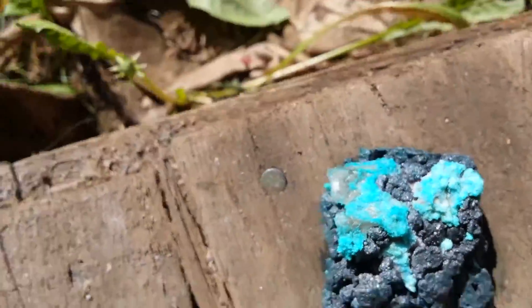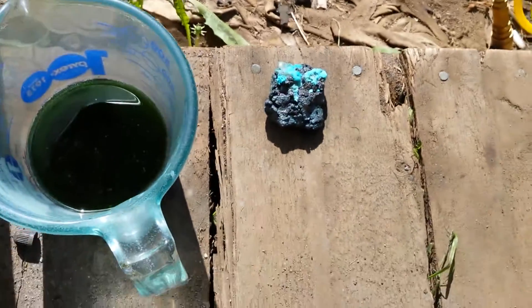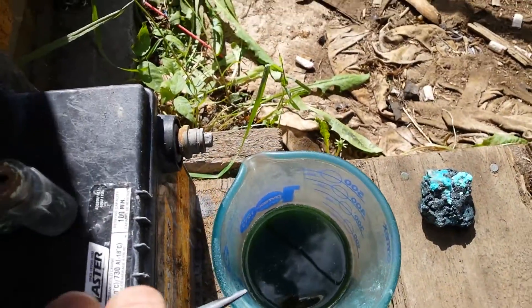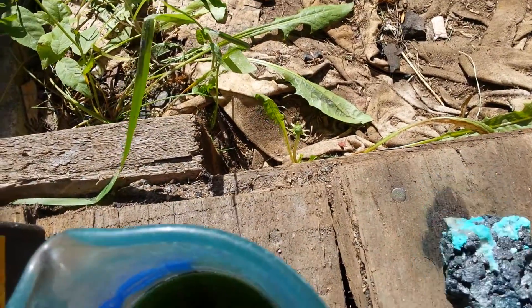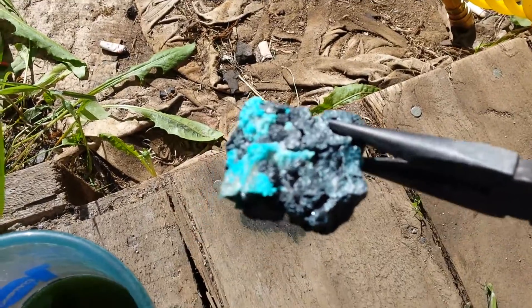It's really cool. I just don't want to leave this one in there because I don't want it to fall apart. So I'm just going to dip it back in a couple more times until all that white stuff's gone and all that blue stuff's gone. And it should be left with just a chunk of silver mixed with probably arsenic and stuff. Because it's getting shiny already too.